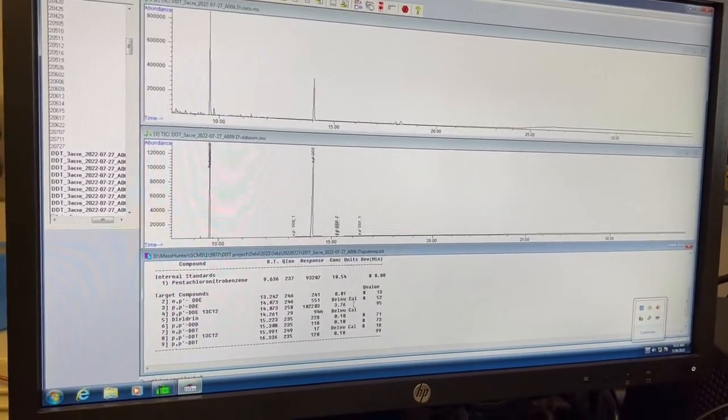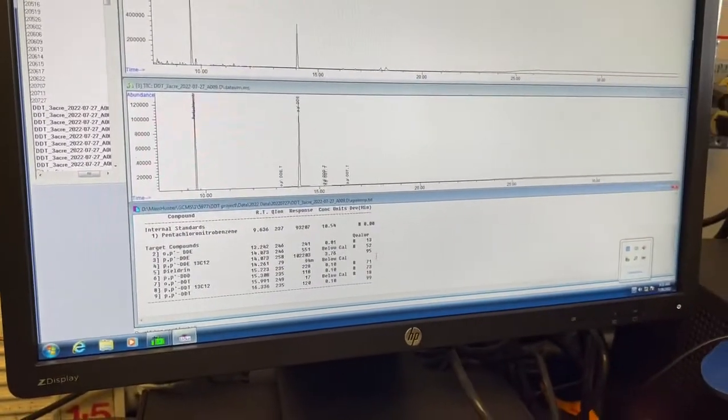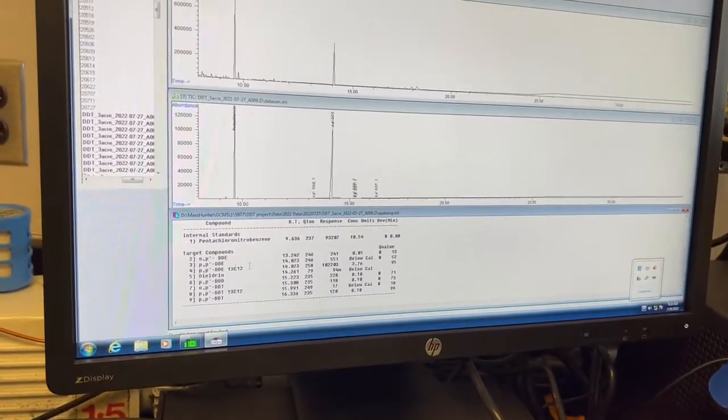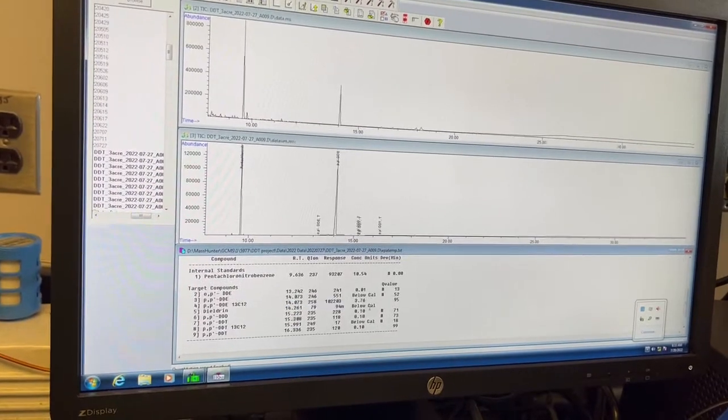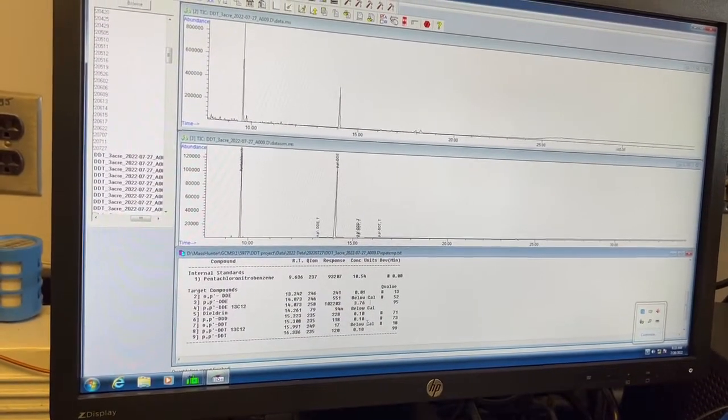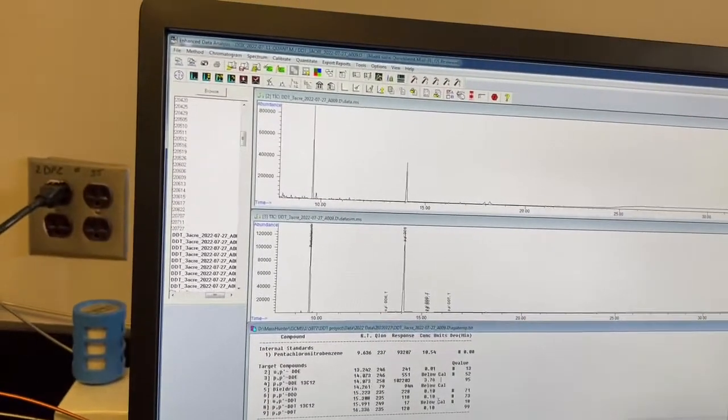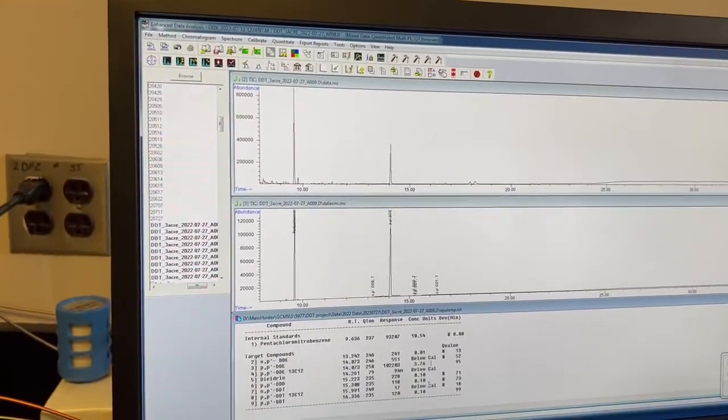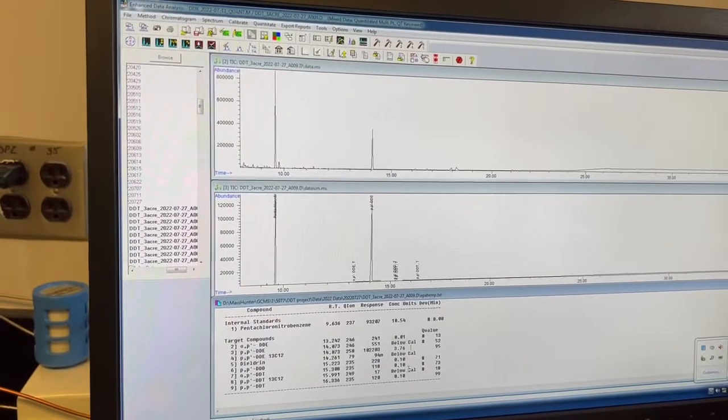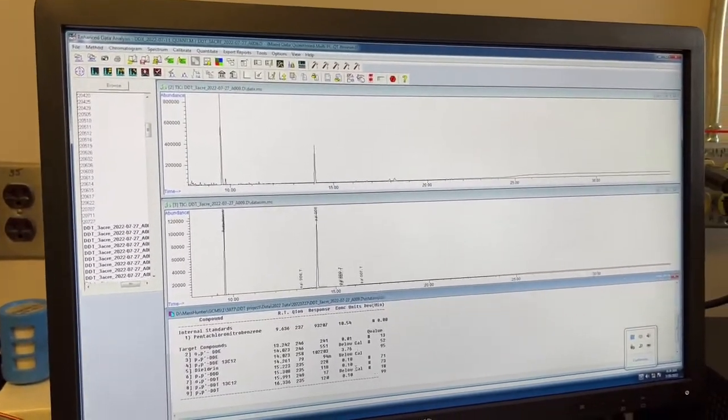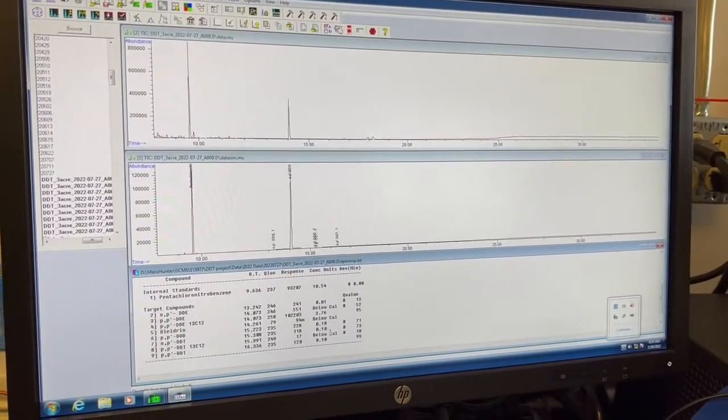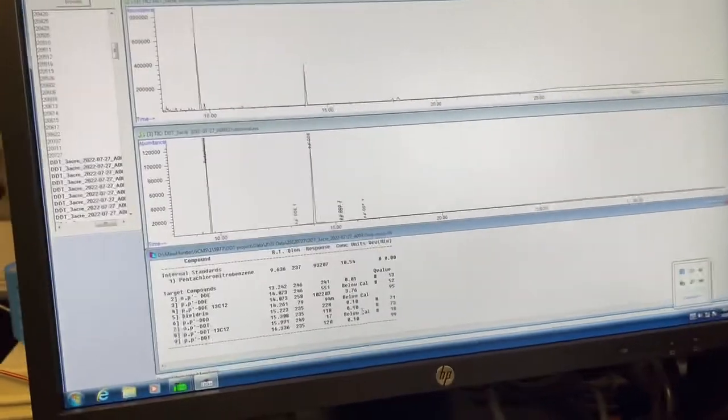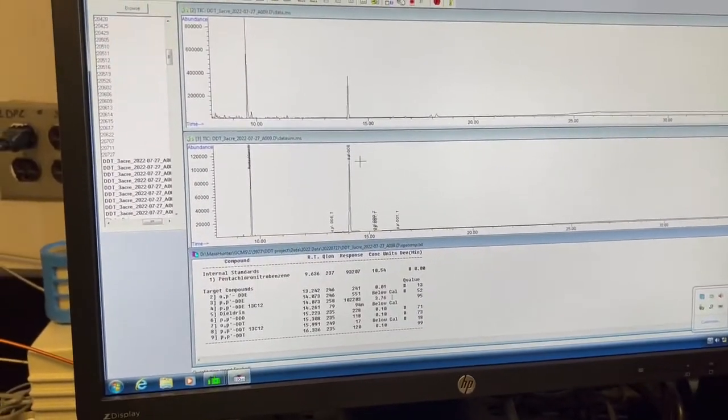So you can see that for all of the species, except for our surrogate, it's below calibration. So that's good. That's what we want to see, because this is sand blank. So we expect that we do not have the concentration of this chemical. So it's good. That means the base was not contaminated or anything.